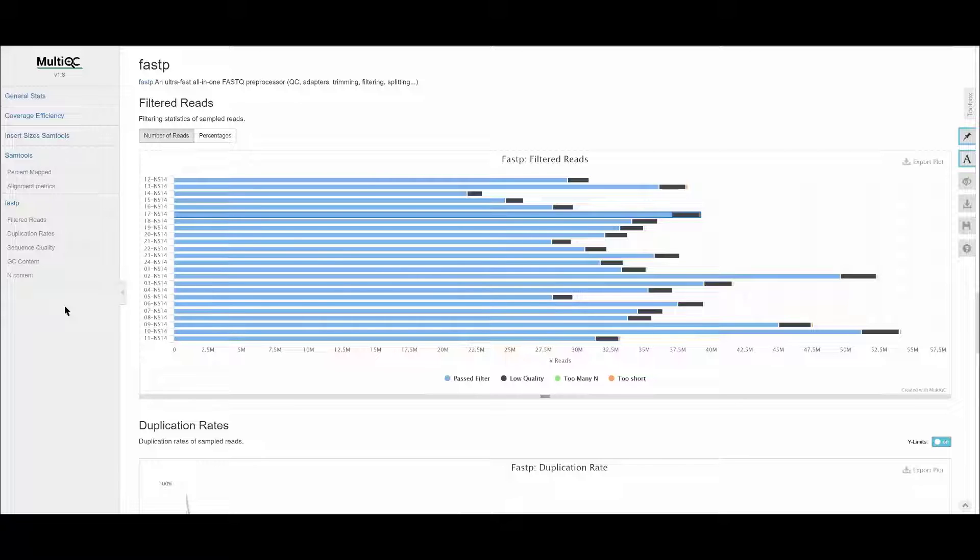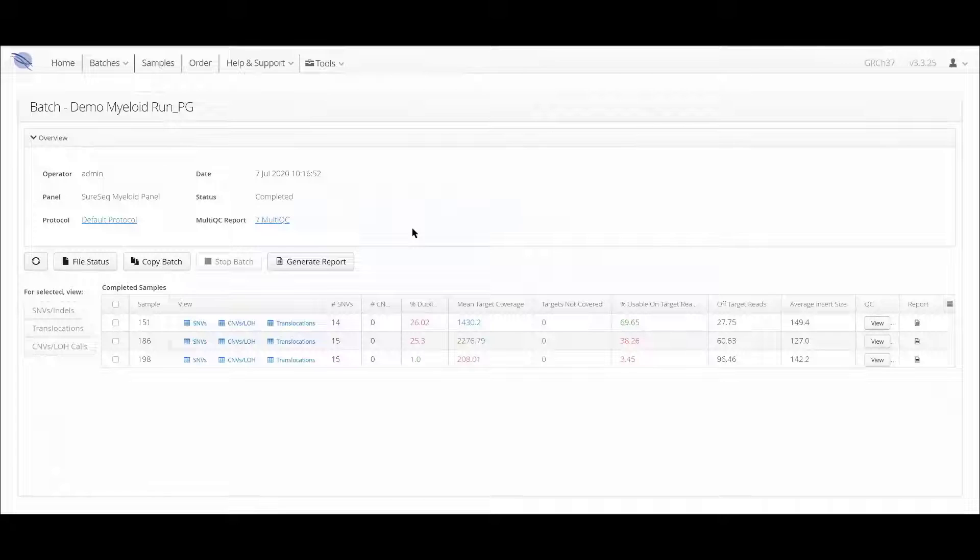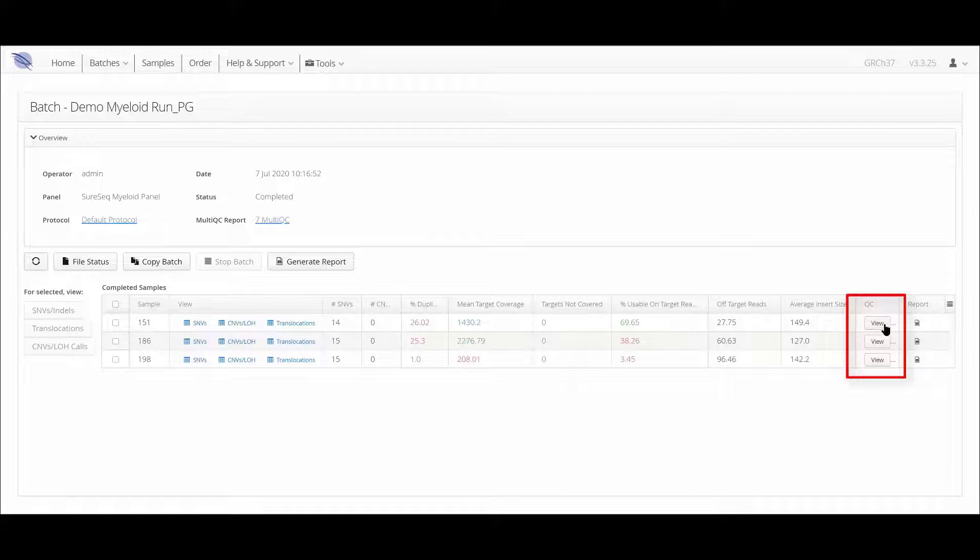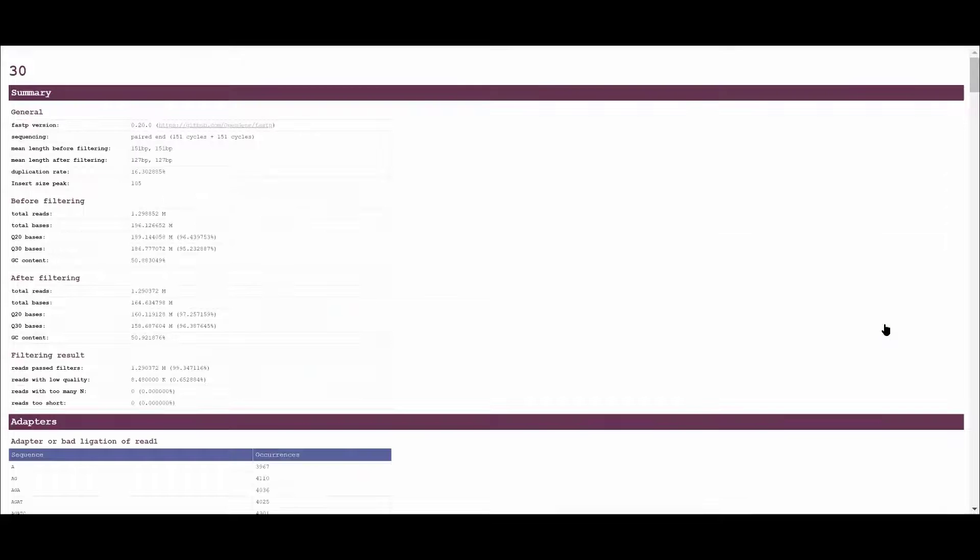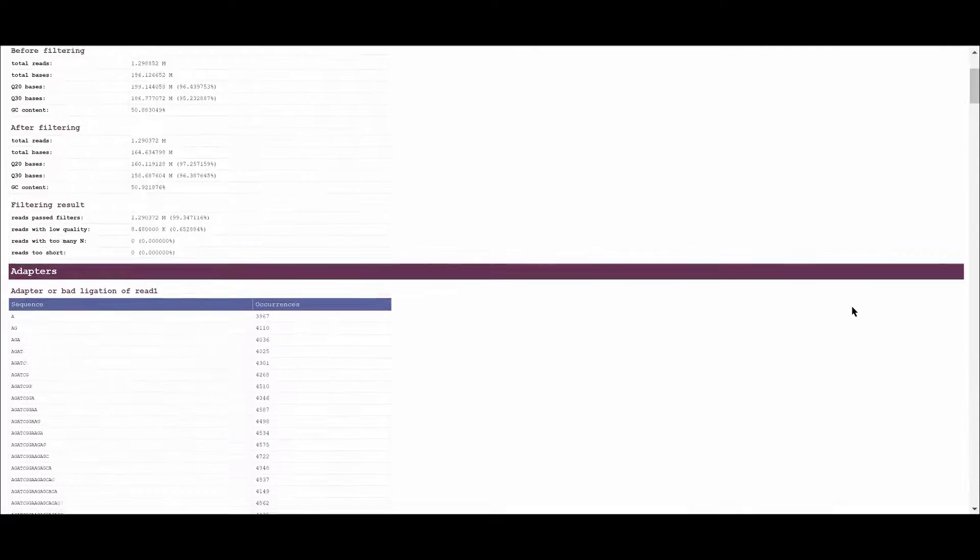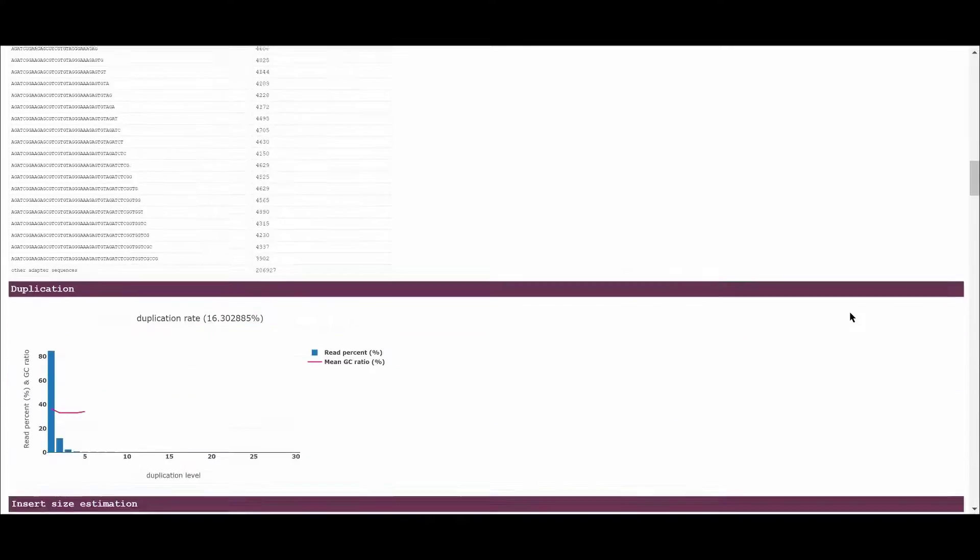If we now return to the Batch page, the second option for viewing QC data is by clicking on the View QC Report button in the row of a particular sample. This option opens up the individual FastP report and allows the user to drill down and view sequencing QC metrics for an individual sample.